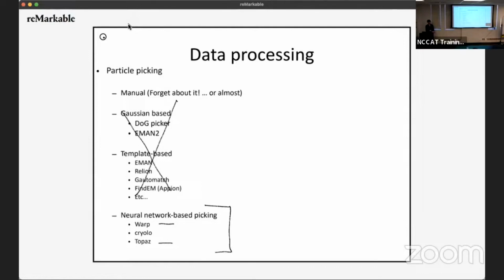That's possible. When you train using your own data set, then the model would have the preferred orientation. So it's not going to help with picking other particles. Potentially, but now the models are not that accurate. So yes, they might pick up on the orientation, but they also pick up on the size of the particle and some other features that are orientation independent. And so it will tend to work anyway. But yes, you have a good case: you might not want to train it to only pick the preferred orientation because that's 95% of your data. So you definitely have a good point, and we should definitely be careful with that.